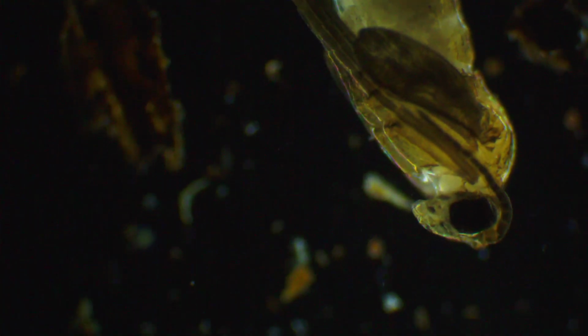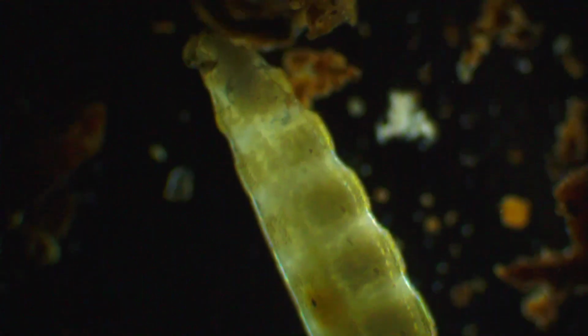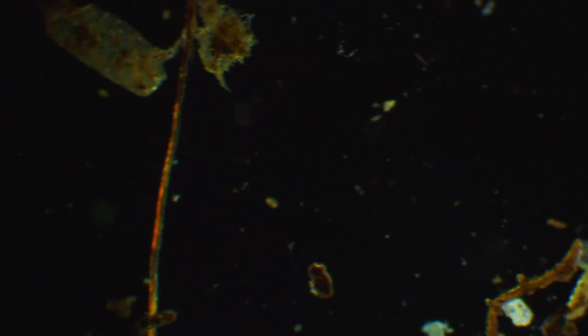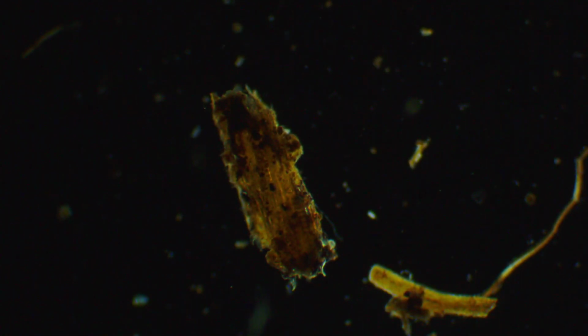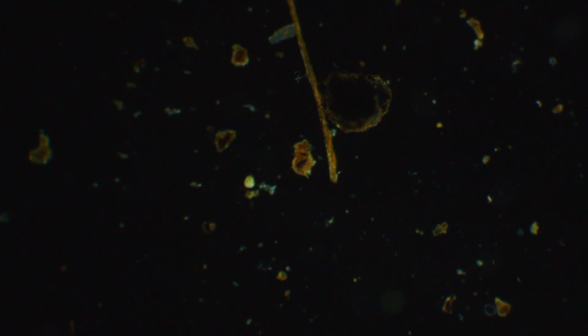I mean, what a specimen. His wings look underdeveloped. Like this was a nymph that did not survive. That right there almost looks like an egg too, some kind of bug. Probably gnats. So we know this soil has gnat eggs in it. As soon as you put a plant with the soil and some water, you get gnats hatching in your house. It's no fun.